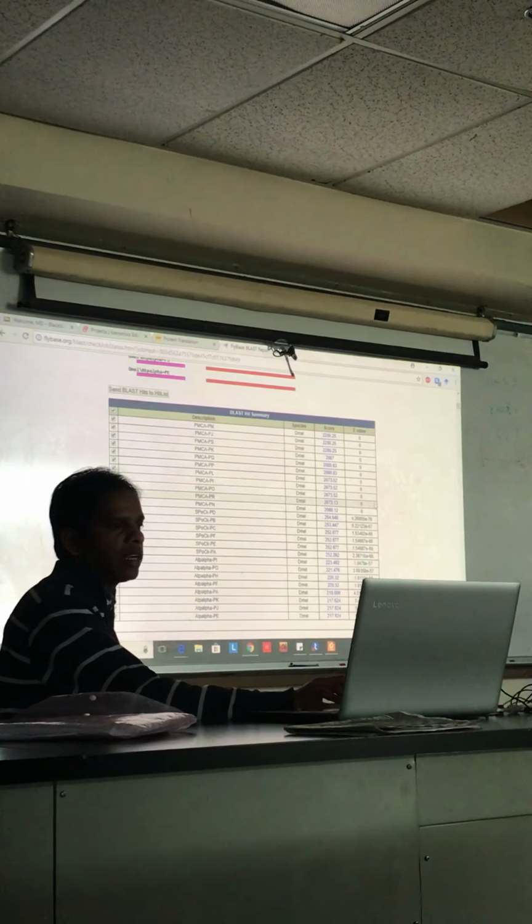Now, the second thing we're going to look at is what it says. Now, use your protein sequence GeneScan to search a database of all Drosophila melanogaster. Provide a copy of the top 20 hits and briefly describe the results. So describing results means you can just explain it like, okay, the first 11 genes have an expected value of 0.